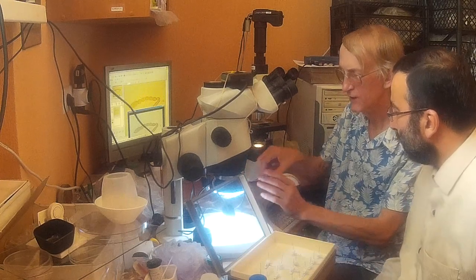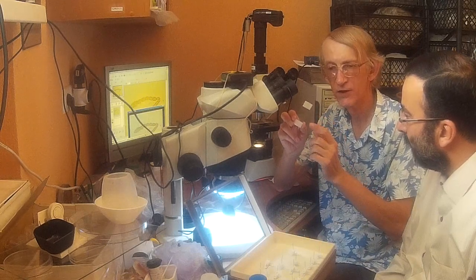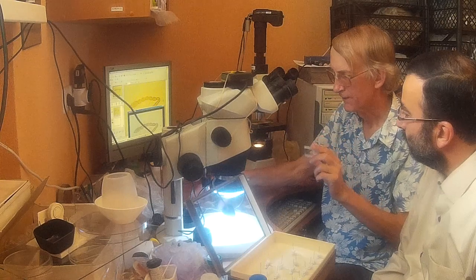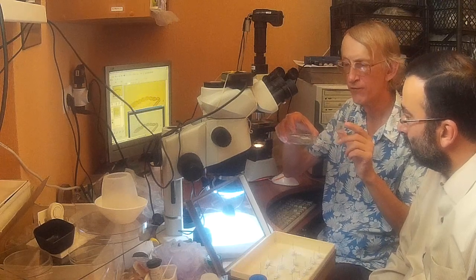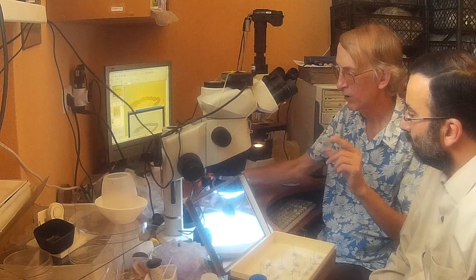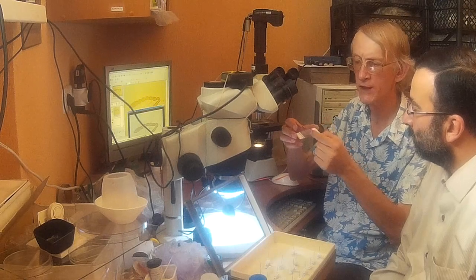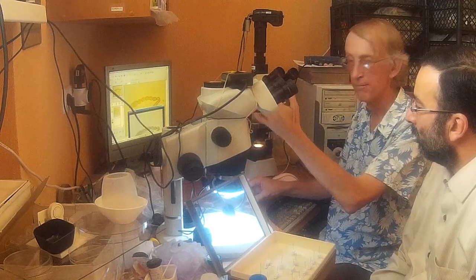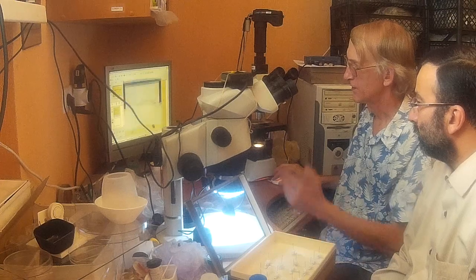And of course to study morphology we need to make special microscopic slides, because the small details of insects are very small, 0.5 millimeter or 0.3 millimeter. So for that we made these tiny special microscopic slides. I studied Trichogramma. Trichogramma is 0.5 millimeter, but details of Eurytomidae are the same size, 0.5 millimeter. For an antenna, for example, we put the antenna in a special liquid, Canada balsam or Faure's liquid, put a cover slip and look under the microscope under different magnification to see all details on the computer screen. We can see the picture online.